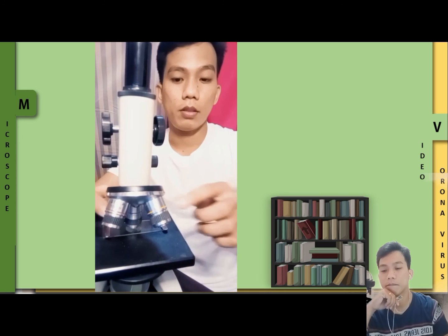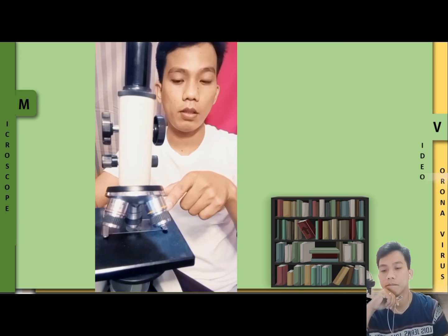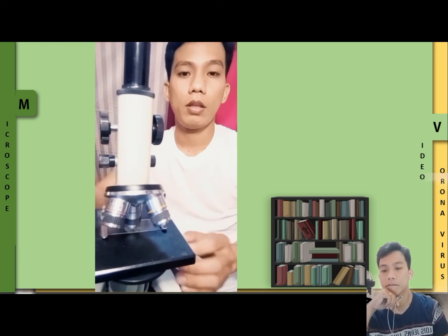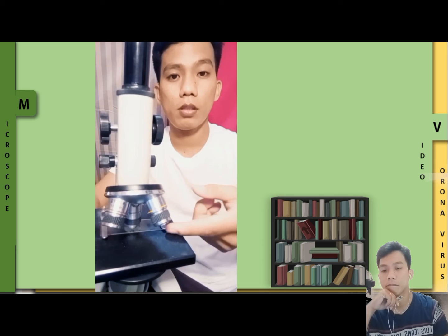Stage clip. Ayan. Okay? So, kahit itaas natin or ibaba ang stage, hindi matatanggal ang slide thanks to the stage clip.